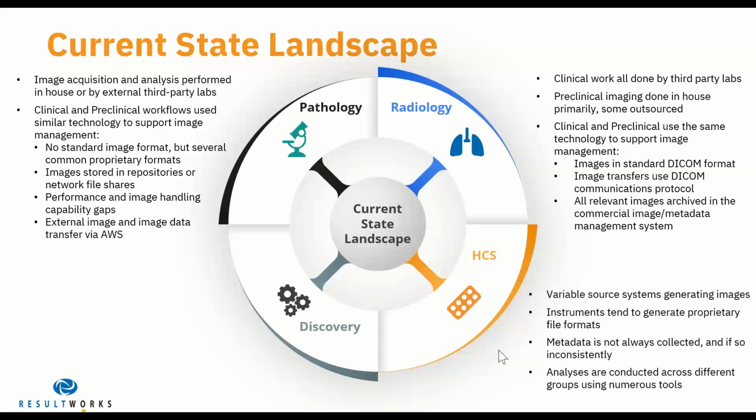And on the high content screening side, there were variable source systems generating images. Instruments, however, tended to generate their own proprietary file formats, which is problematic in pretty much everything we do. And metadata wasn't always collected, and if it was collected, where it was collected, it was done inconsistently, not really following any standard practices. And then analysis were conducted across different groups using numerous tools.